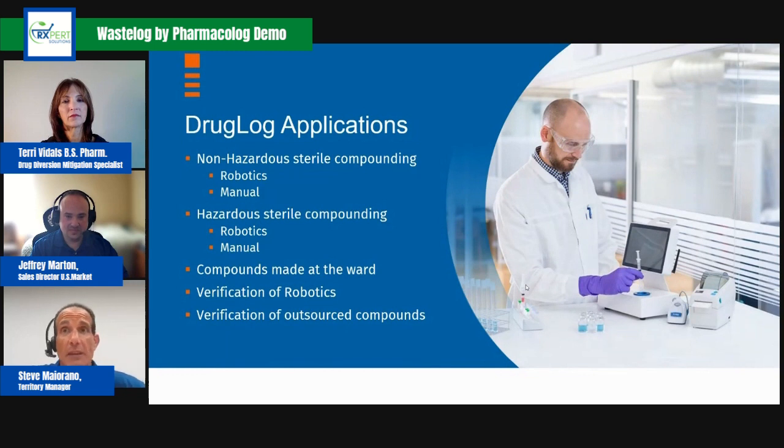And outside of chemo, just even batch filling, utilizing robotics or manual. Also for verification of the robotics that's in the pharmacy or after maintenance. So if a hardware maintenance upgrade or a software upgrade happens on the robotics, prior to it going into service, they would run a sample and then test it with our DrugLog system to verify that it's still working the way it should.